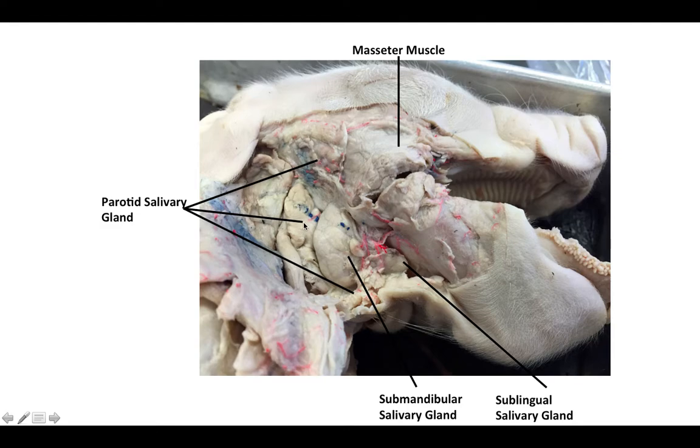Nestled on the inside of this crescent is a smaller, although still substantial, submandibular salivary gland. This one is usually quite round. A lot of people accidentally mistake it for the parotid gland because it's pretty large, but if it looks big and round, and you can see some glandular tissue behind it, then the one behind is the parotid gland, and this one is the submandibular salivary gland.